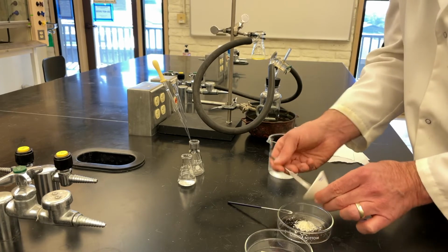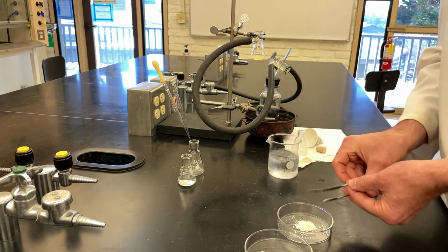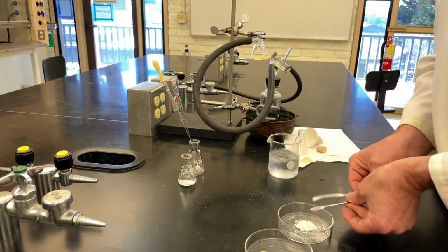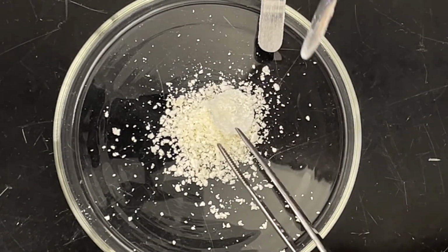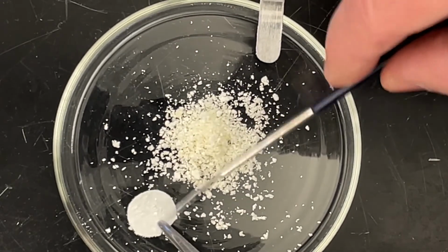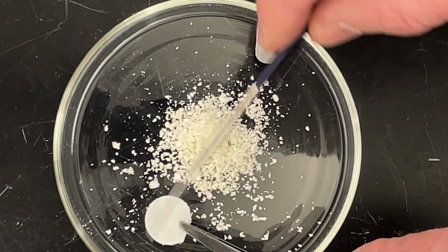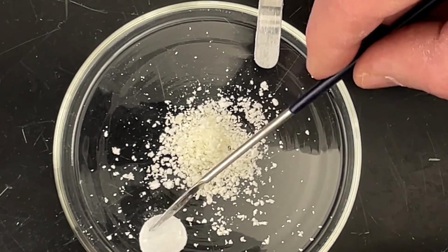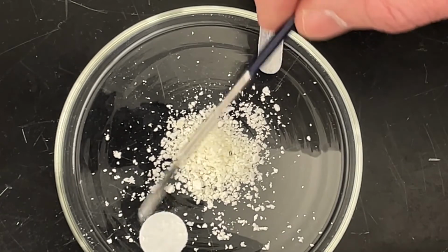All right, we'll get this over. Maybe we'll get a shot of this before we go weigh it. I'll show you what it really looks like up close, and then we'll go get a weight on it. Okay, just a quick cleanup on this material and to get the filter paper out of here. Now the filter paper is pretty darn wet. That's when we really got to be careful. That's when it's easy to tear it and easy to start pulling bits of paper fiber off. So we'll just go gentle with that.